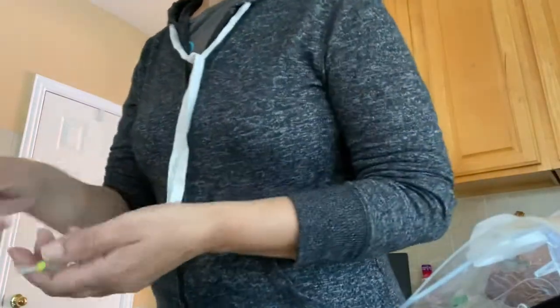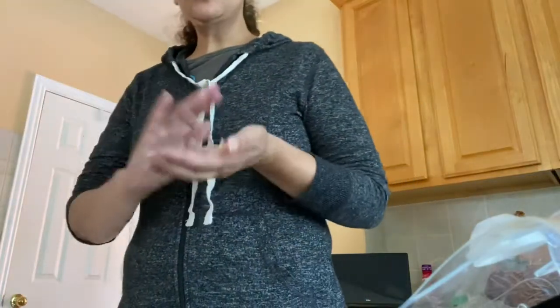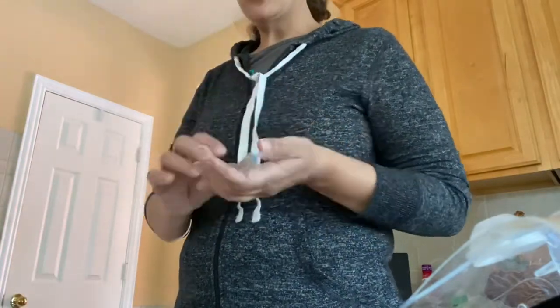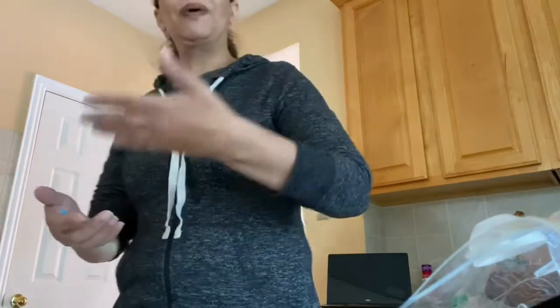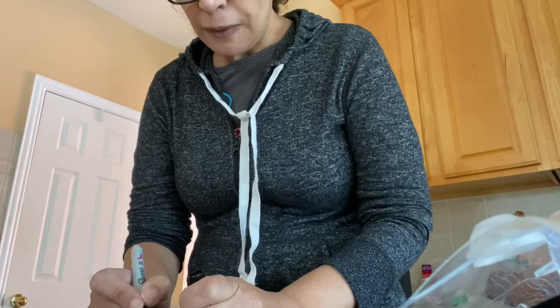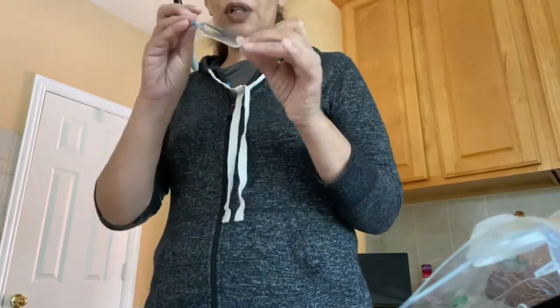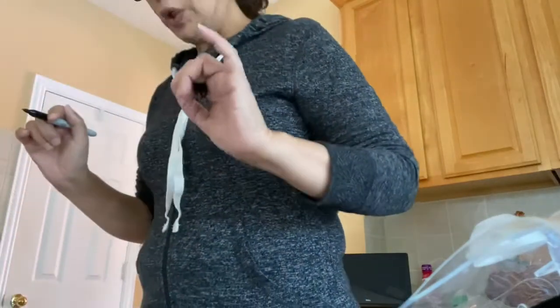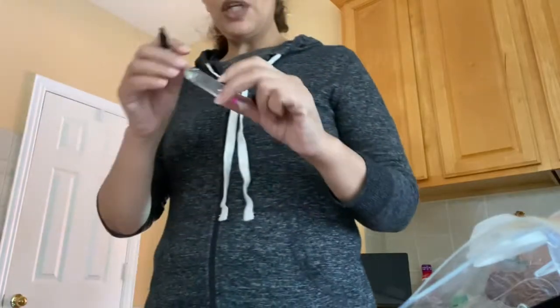So all we are doing is putting different solutions of sugar inside of those bags. And we are using different colors of rubber bands because we are going to put those back together, and each bag does not contain the same concentration of solute. The solute here is the sugar. So the blue one is 1%. My problem with the marker is that if I put it in, it may be erased, so I'm using different colors of rubber bands. So the blue is for 1% sugar. The pink is for 10% sugar.